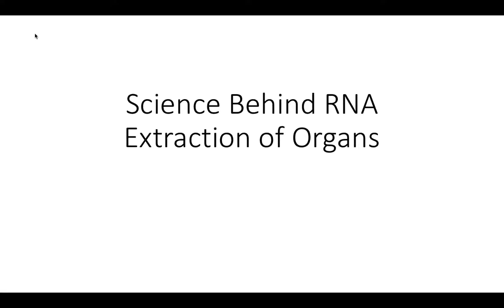All right, today I'll be talking about the science behind RNA extraction of organs. I'm not going to go in depth into what RNA is and the whole big picture, because that's a whole lesson in itself. This video is strictly for understanding the science of RNA extraction: what it is, why we do it, and what each step means.